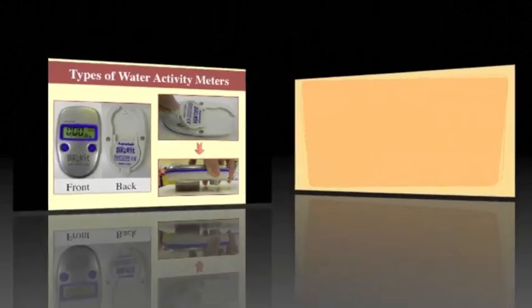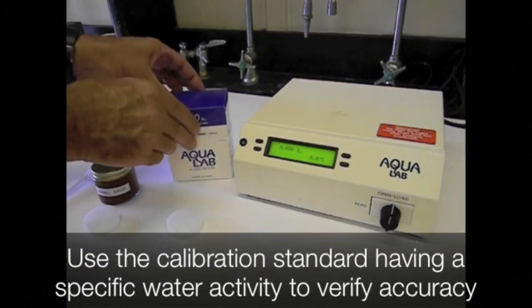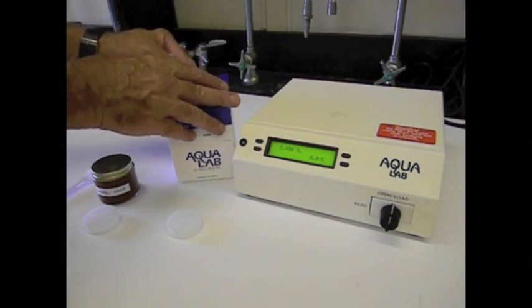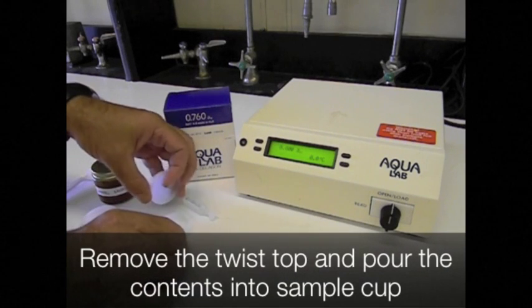We will first show how to calibrate the benchtop meter prior to taking water activity of a caramel sauce sample. Use the calibration standard having a specific water activity to verify accuracy, in this case 0.760.